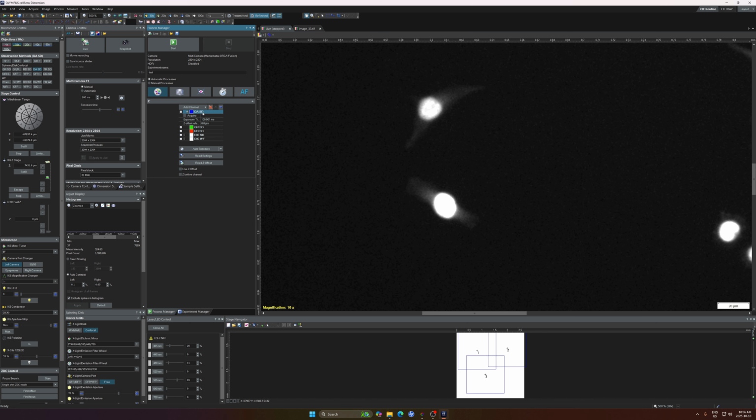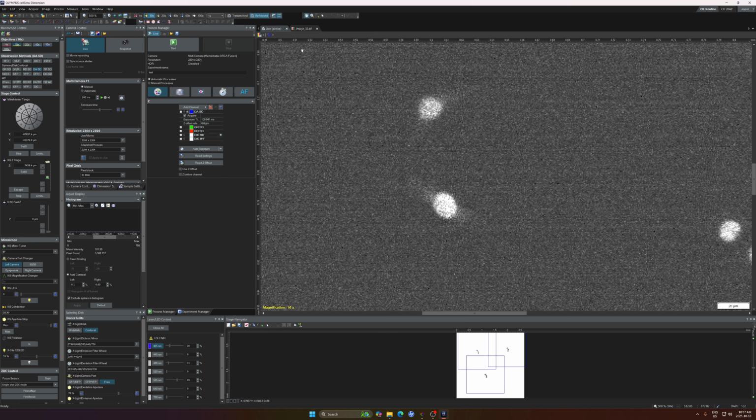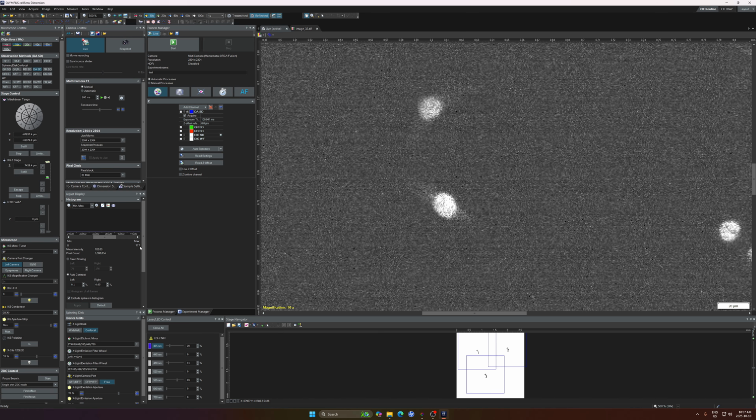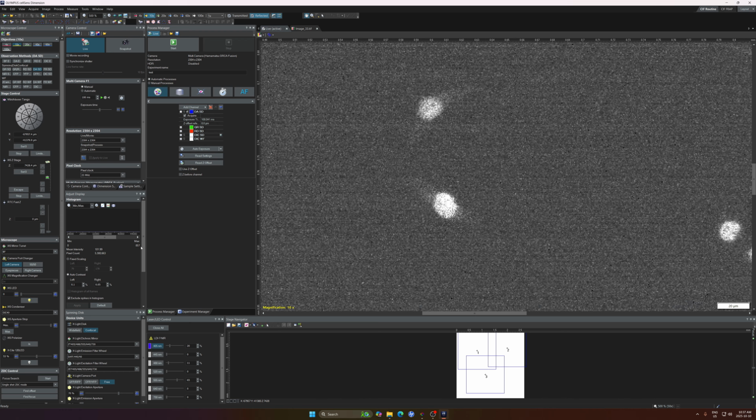Now, if I select this wavelength, I go live. This works. Right now, this acquire check mark is not marked, which means this channel would not be acquired. If you check it, this picture will be taken. The first thing you notice is that this picture has a very low signal to noise ratio. It dropped from 7,000 to 800. That's basically the spinning disk cutting out almost 90% of the light.